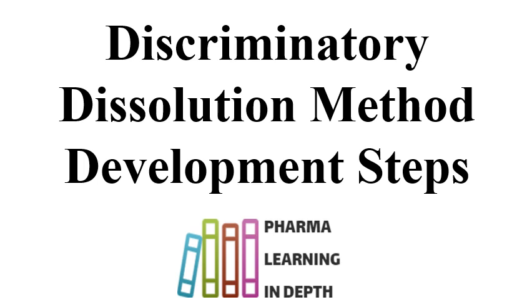But here in this video I am mentioning because sometimes because of the specifications the dissolution media may prove to be discriminatory or may prove to be under discriminatory or over discriminatory. So selecting the specific acceptance criteria is very critical when you are going to prove the discriminatory dissolution method.